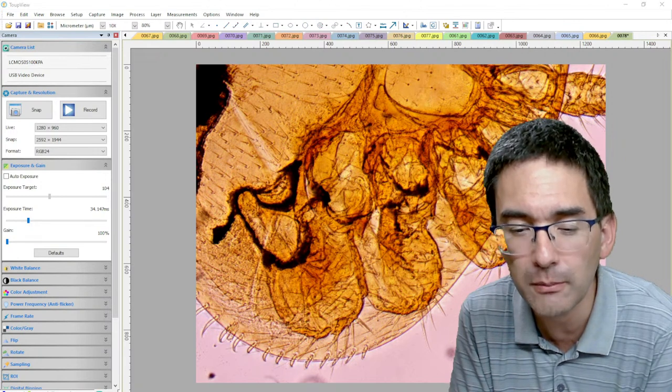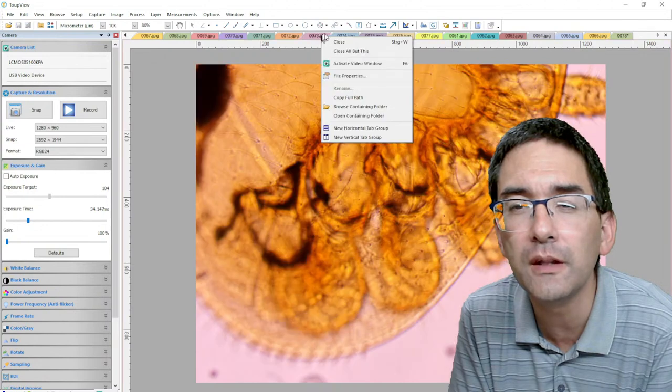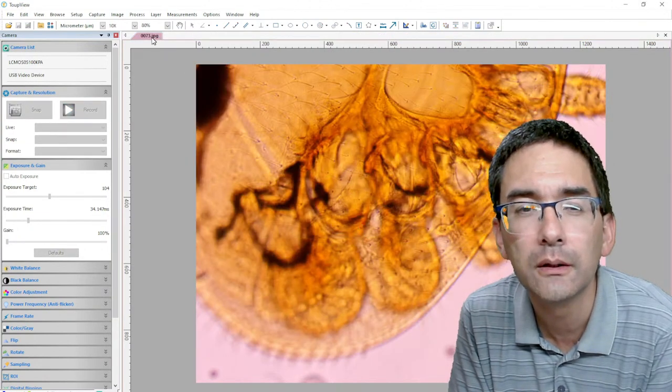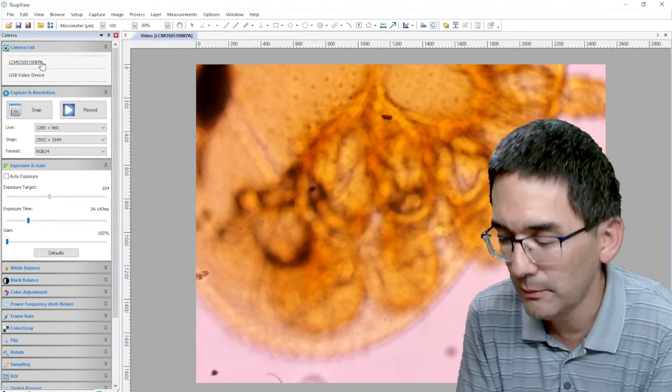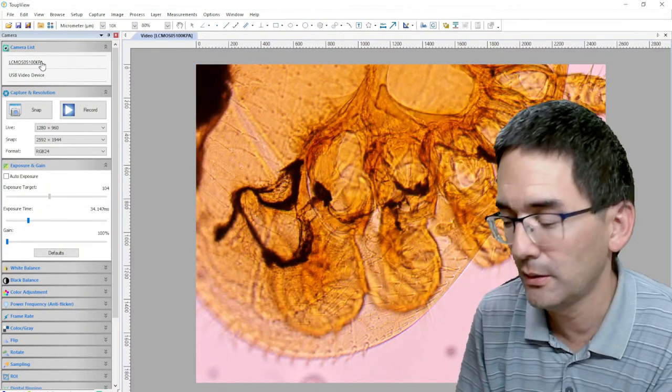Basically you can do something similar. Yeah, that's the last thing I wanted to show you. Let's remove everything here again, close all, and let's reclose this here as well. We go back to the camera, and let's put this again into focus.